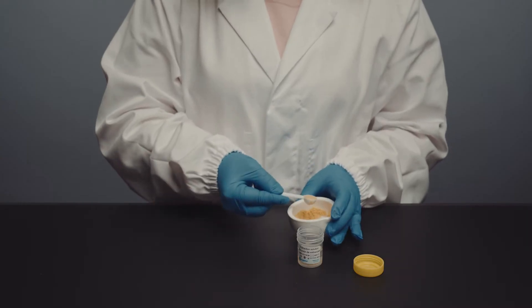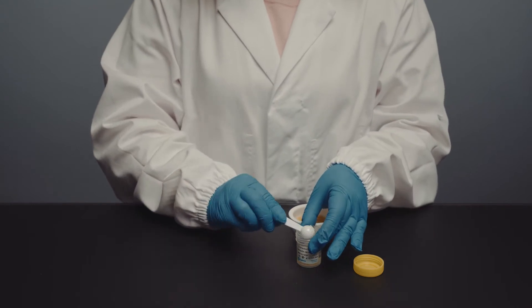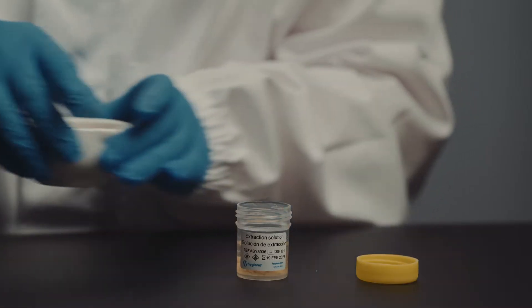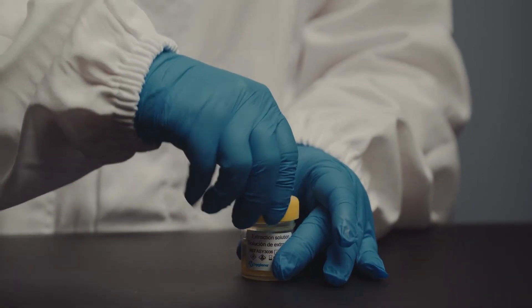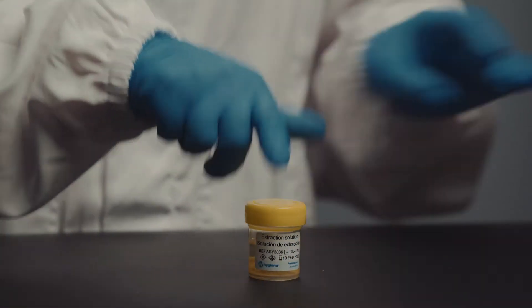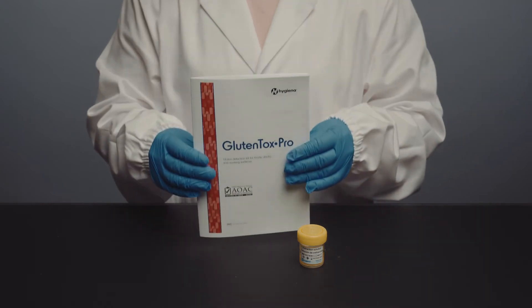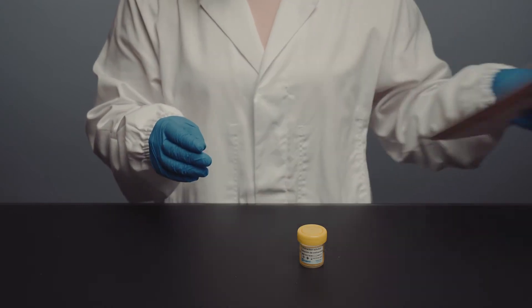Step three, add two level scoops of the cookie crumbs to the extraction buffer. Note that the number of scoops of a sample that need to be added will depend on the type of sample. An easy to interpret guide is supplied in the kit instructional manual.